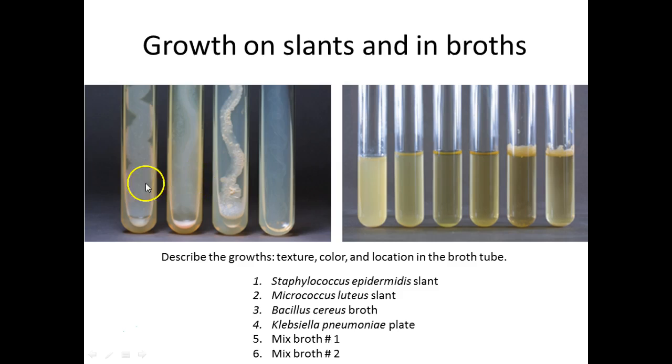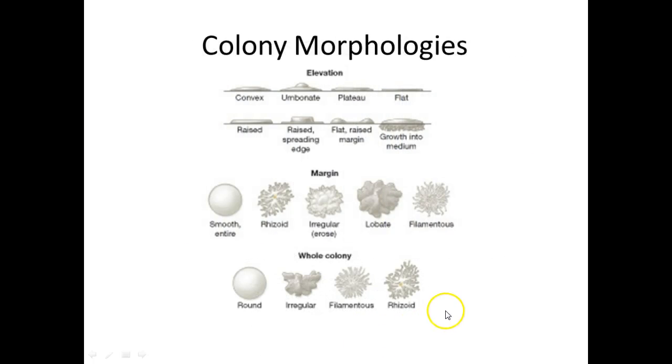So we've already kind of mentioned what the organisms look like when they grow. Today we saw mostly creamy white, right? But later on we'll see even chalky, dry looking white cultures. Others like this one, you're looking at it and go, I don't see anything, right? Kind of translucent. There'll be some that'll be cloudy all throughout, especially motile organisms. There'll be organisms that require air, that are strict aerobes, and they'll only grow at the top of that tube, because if we're not mixing that tube, where's the oxygen? At the top, right? So these are the ones we have for today. Thankfully, they all grew, right? And we only did one mixed broth today. In the past, we've done different ones.